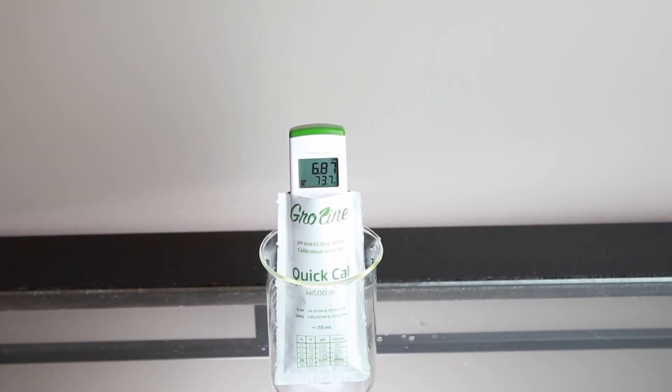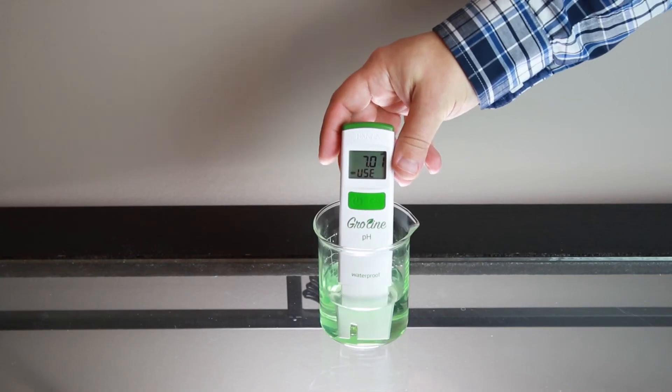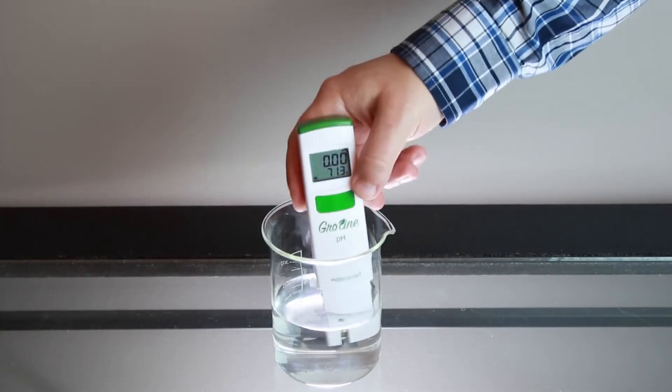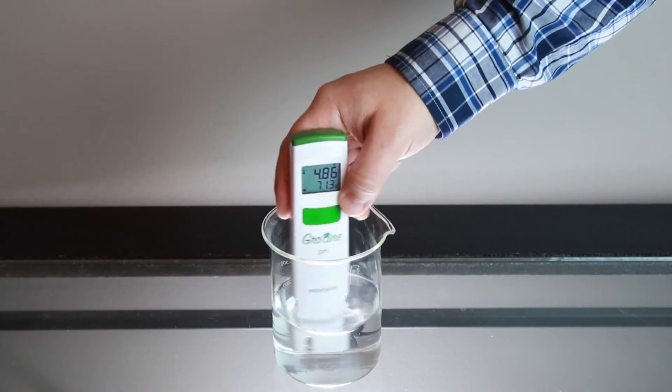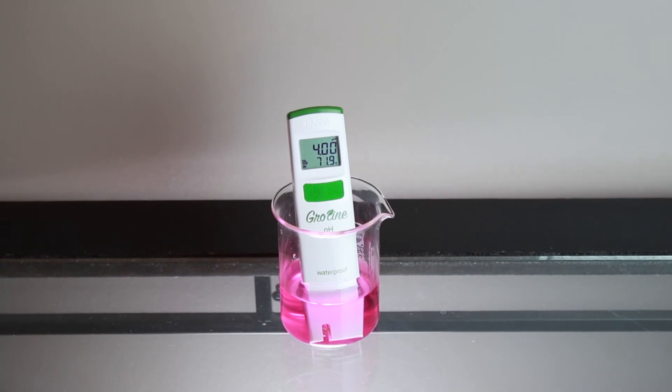To calibrate your tester to two points, make sure your meter is in the Cal Standard setting and place your tester in your HANA calibration buffer. The tester automatically recognizes which buffer you use first. Once recognized, it will ask you for the next buffer. Rinse the tester in distilled or deionized water and place it in the next buffer. After it's complete, the meter will automatically return to measurement mode. The tester is now ready to be used for measurements.